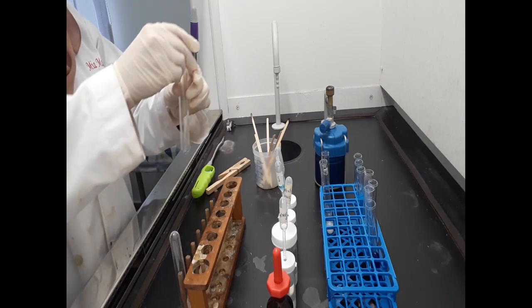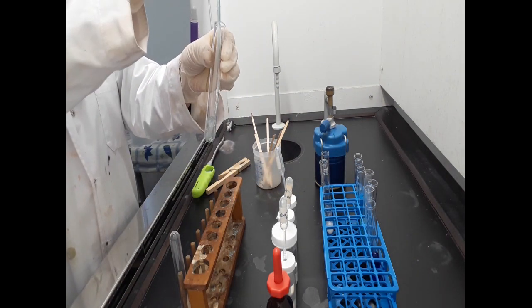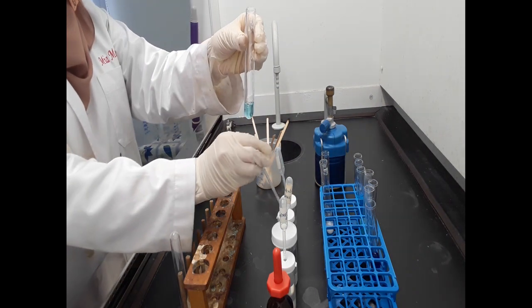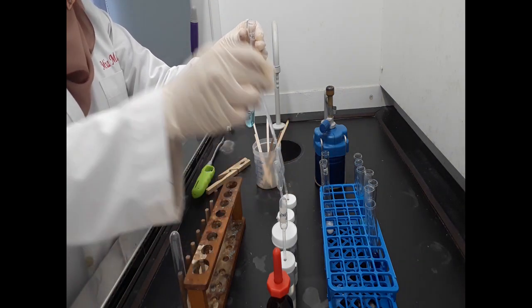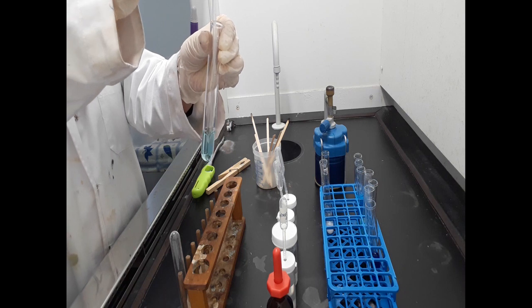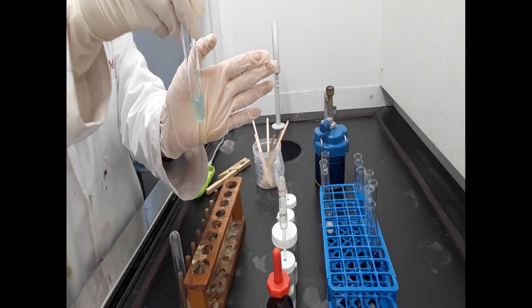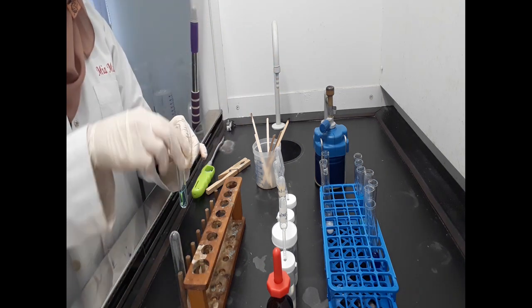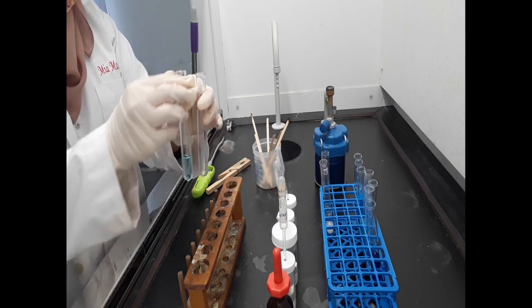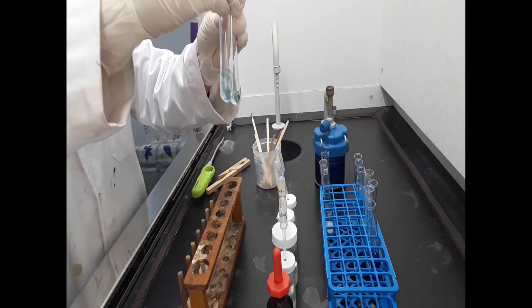So let's move on to solution S. Same thing, 1 centimeter cube of solution S. Add an equal volume of dilute nitric acid. No reaction. And then pour half of the mixture from A into a test tube.